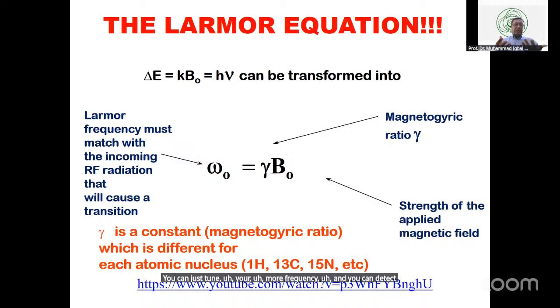Now, I told you that in quantum physics, Larmor frequency is measured only by resonance frequency or radio frequency, because that has to be exactly matched. So the Larmor frequency of carbons of different kinds has to match with the radio frequency which you apply, and radio frequency gives you flexibility of detecting one element in the presence of others.